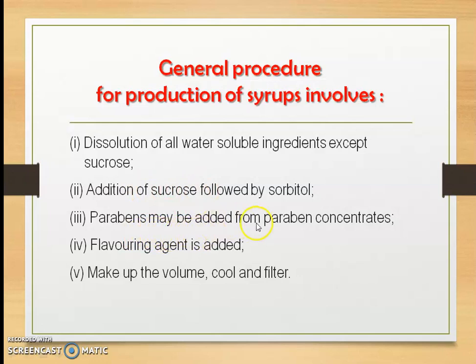Parabens may be added from paraben concentrate. Flavoring agent is added. Then you have to make up the volume, cool down, and filter the solution.